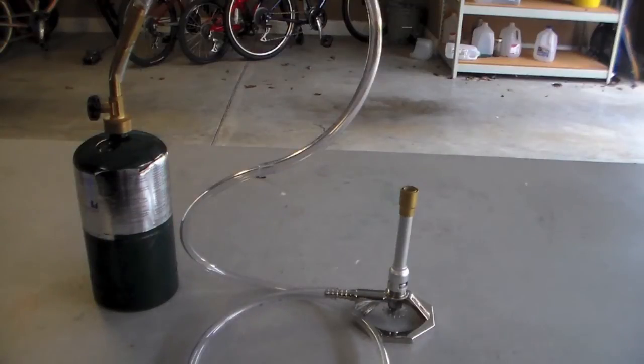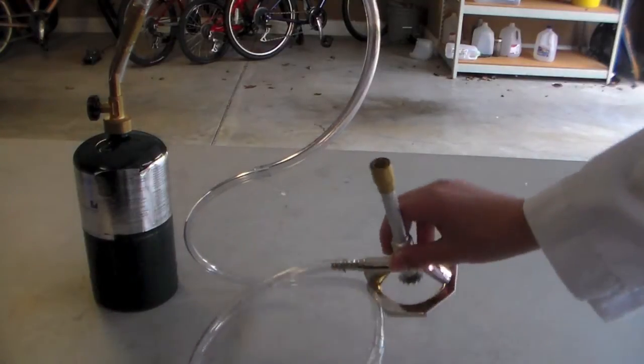Hey guys and welcome to The Shack. In this video I want to show you guys my homemade propane fuel source for my Bunsen burner.